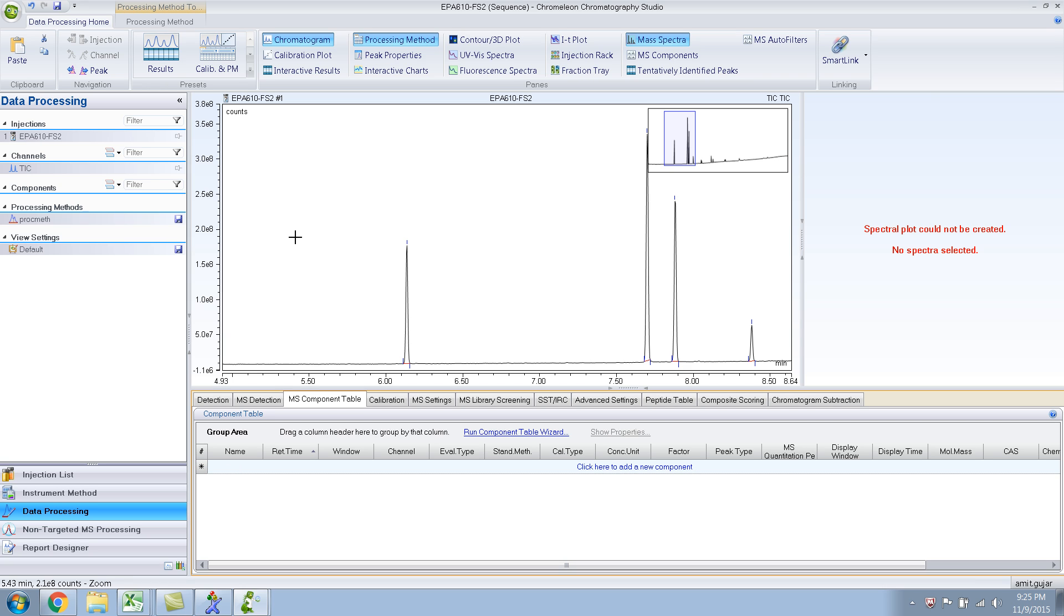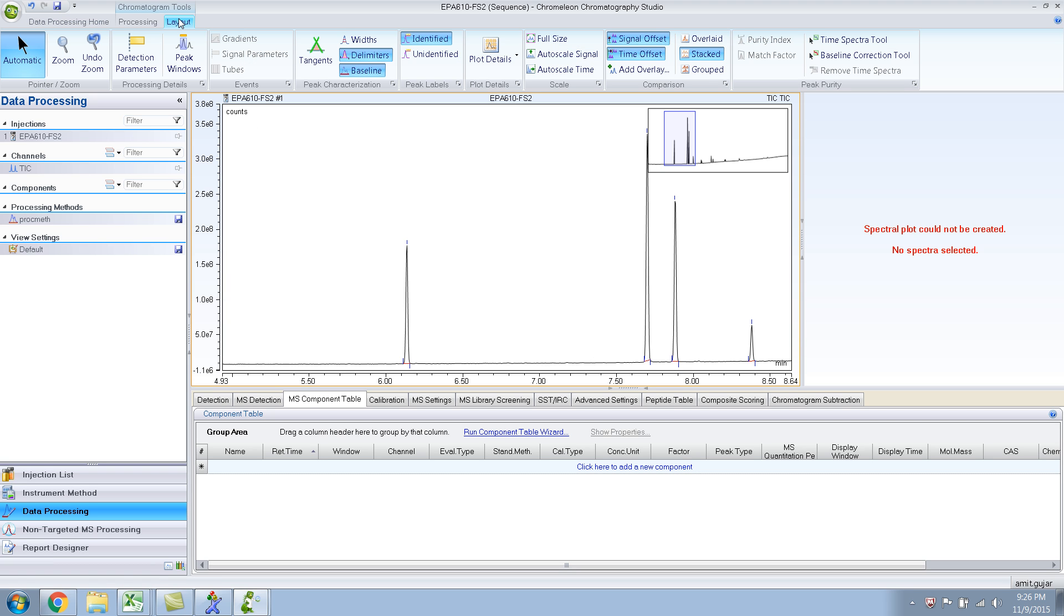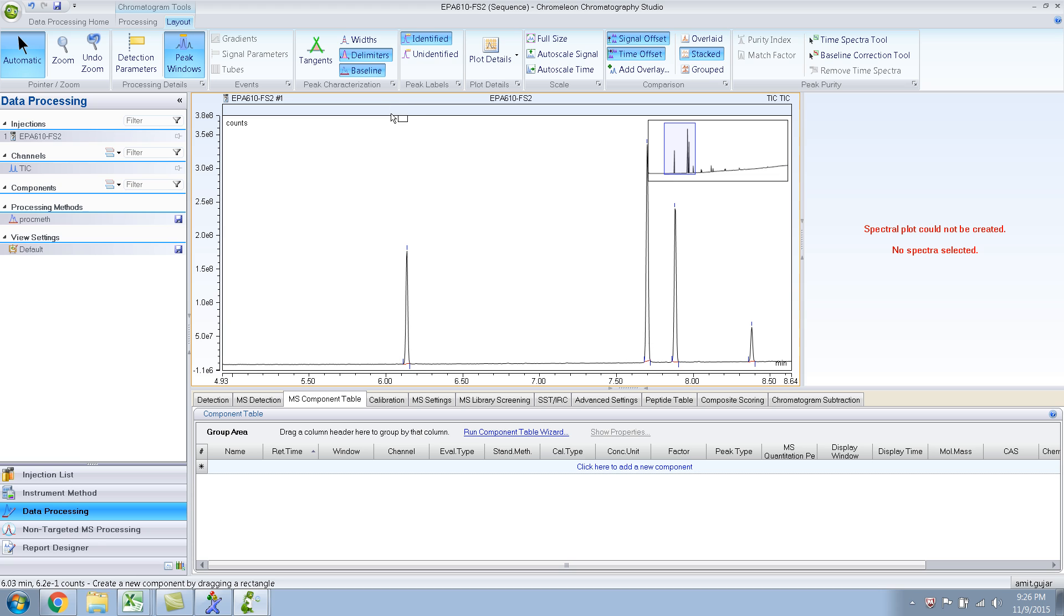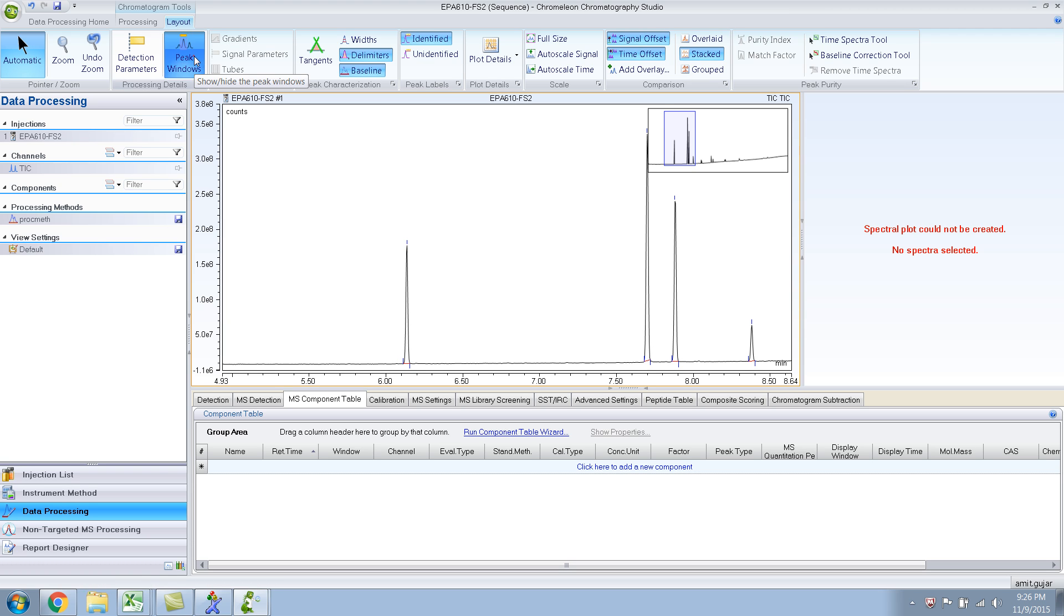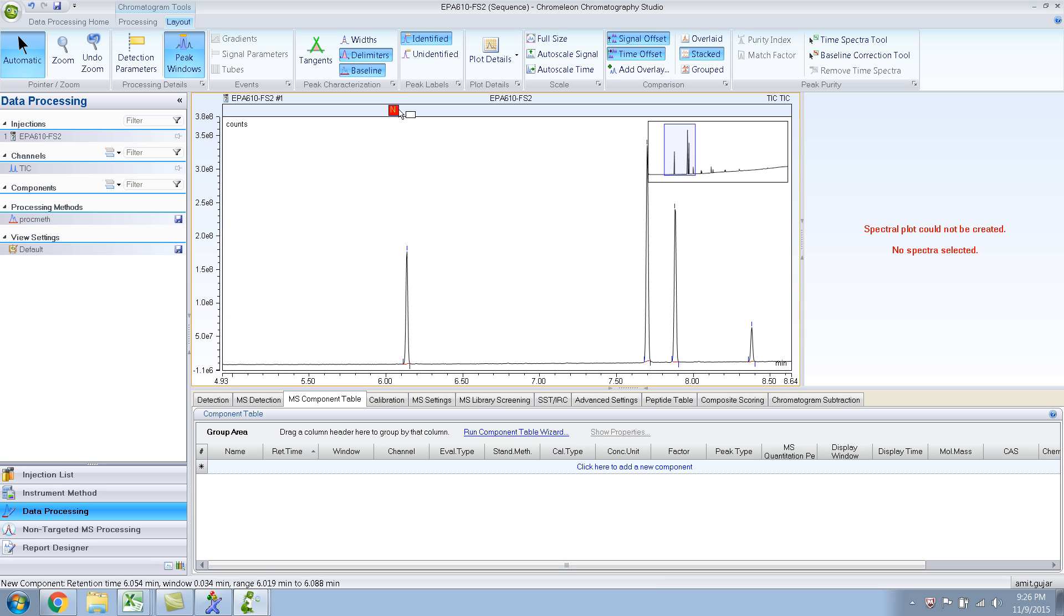Another way is you go to your chromatogram pane and then go to the layout. And you see this peak windows, so you click on the peak windows. So what happens is if you observe it creates this sort of a bar over here. So let me do it again. Unclick, it goes away. Click, it comes back. So what you do is you take your cursor near the bar and near the peak and just drag this.